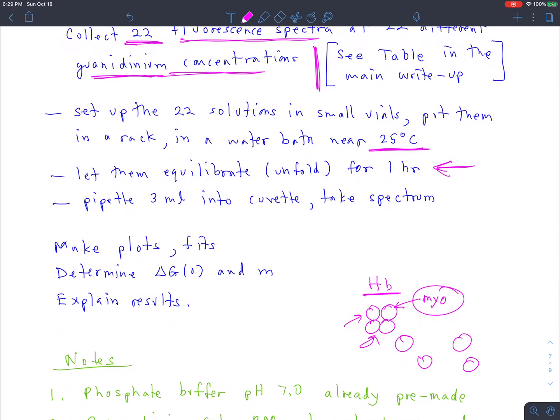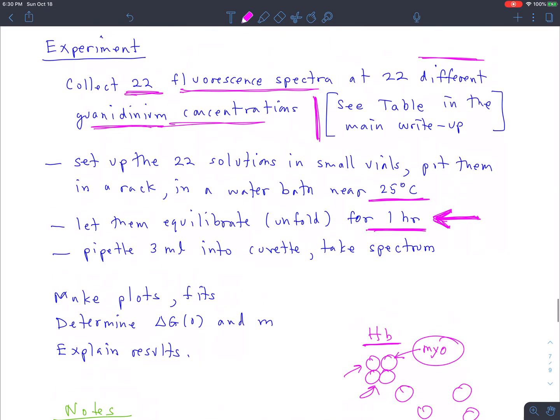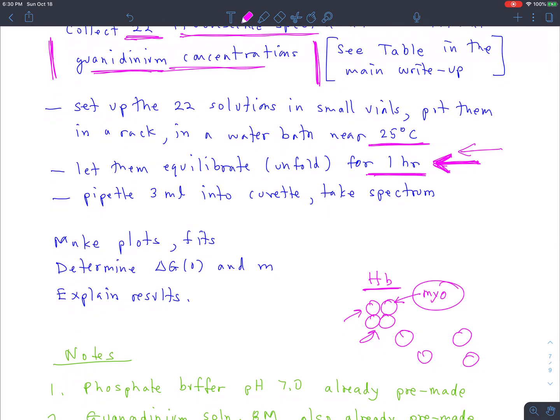Unfolding doesn't occur instantly, so you've got to let them sit for a while. Sitting for an hour means we're twiddling our thumbs for an hour, and we're always running short of time in these experiments, so this is a relatively long experiment and we should be efficient. Everybody should be highly prepared to work efficiently. If you spend an hour setting up these vials and then wait another hour, and then wait some more because there's only one fluorimeter and the other guys are in front of you, you might be there late, and you don't want to be there late, so be efficient.